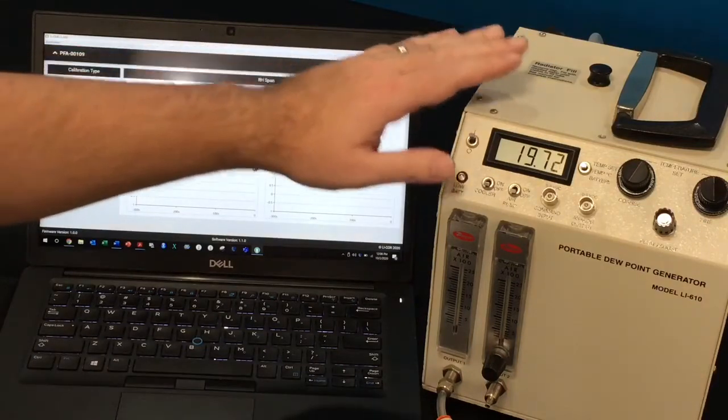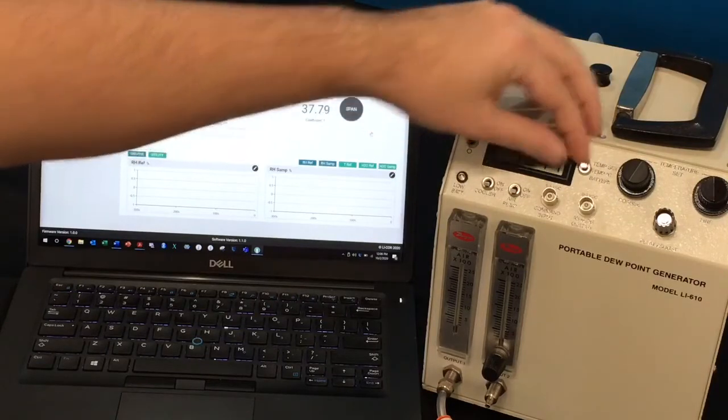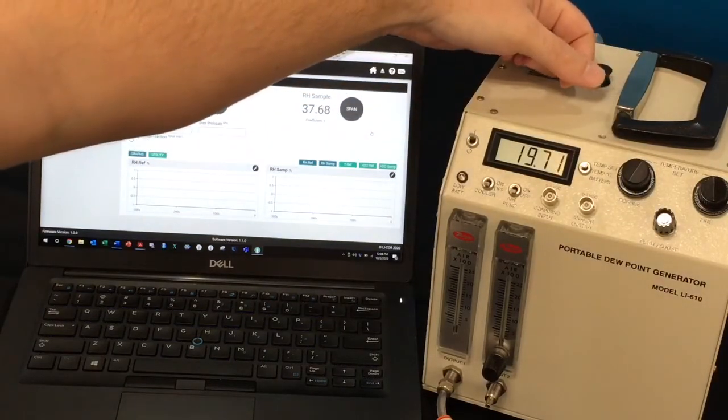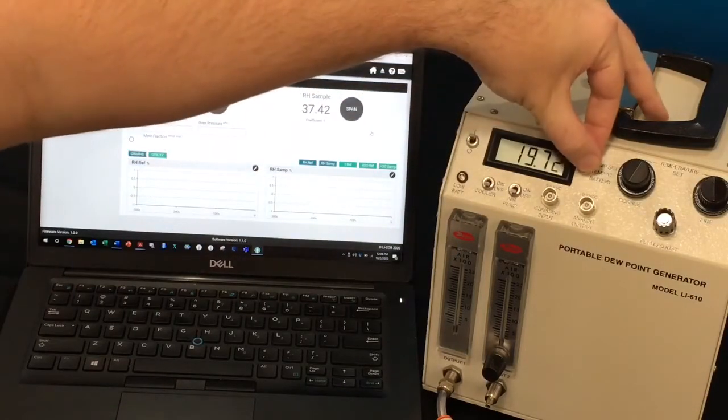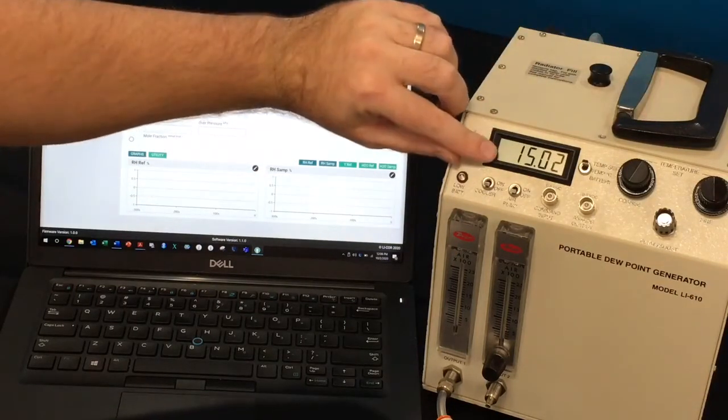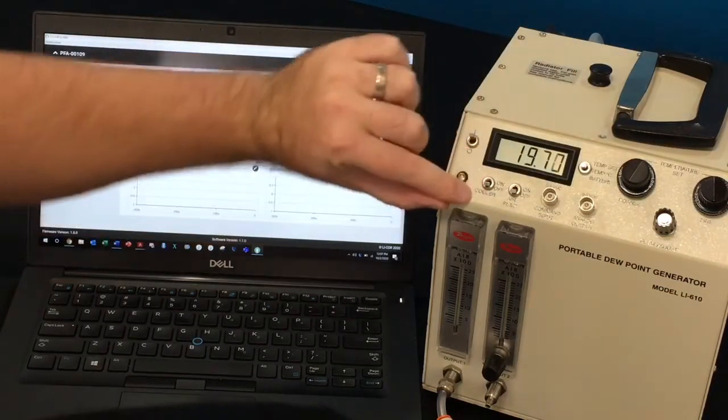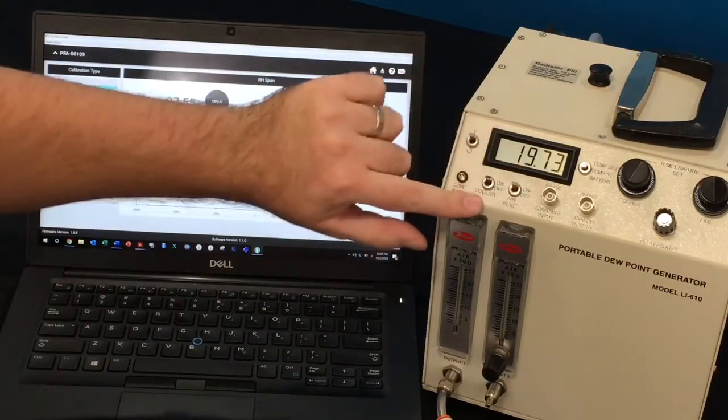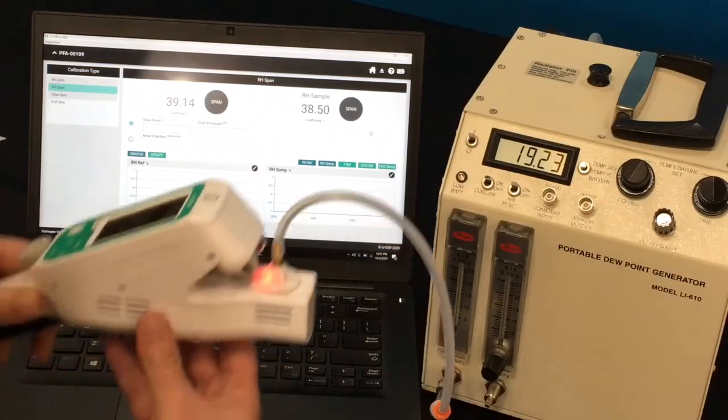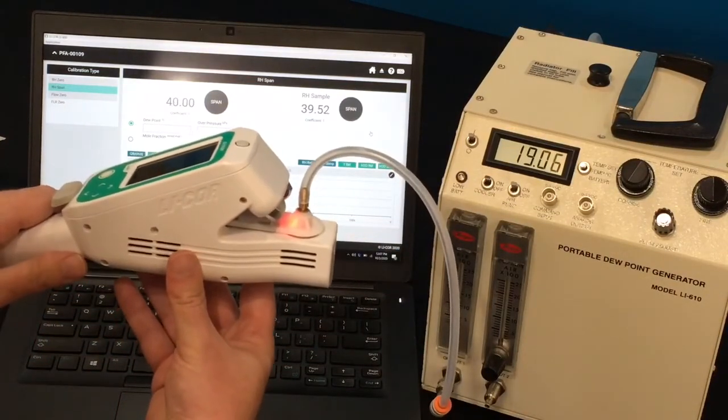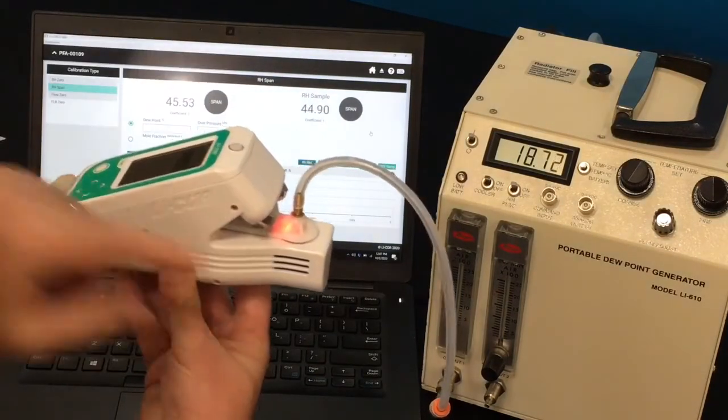Now we'll want to turn on our LI-610 dew point generator, set our temperature to something slightly lower than ambient. So right now my instrument is at 19.7 degrees, but my set point is at 15 degrees. And we will now turn the cooler and the air pump on. And now we are flowing an airstream with a known water vapor concentration into the LI-600 through its calibration clamp.